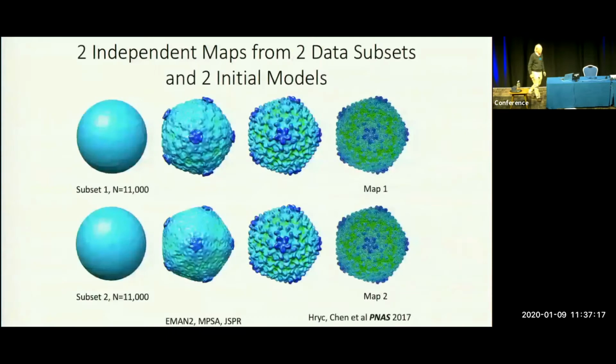As pointed out in some of the previous talks, in the 2004 cryo-EM meeting we agreed that, because we don't have a so-called R-free as in crystallography, we can collect 2 sets of data. One set of data, we start with some set of particles and create a map, which we call map 1, and another independent set of data we use to generate map 2.